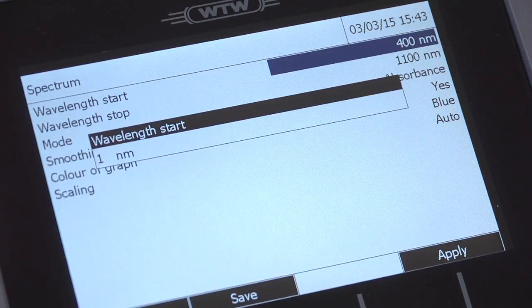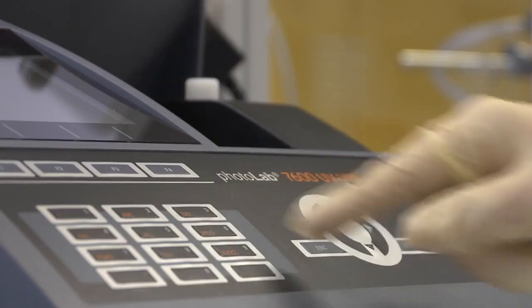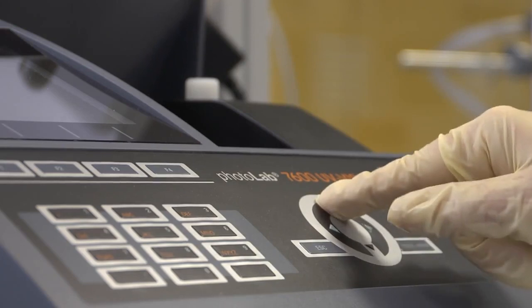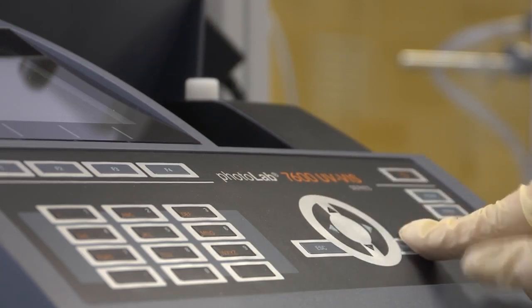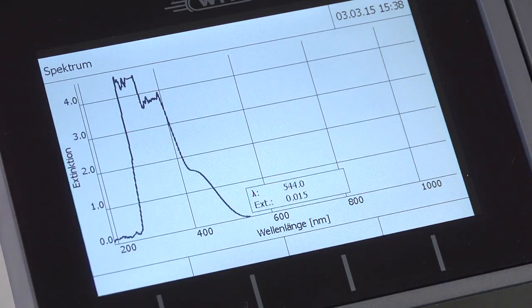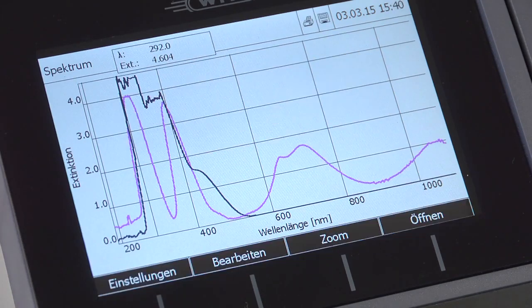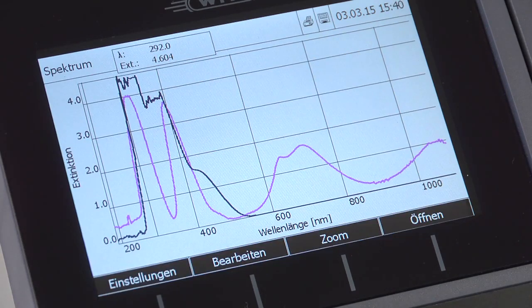We run the spectrum from 190 to 1,100 nanometers and put in these values. We are now going to compare the spectrum with a reference spectrum, and we can see clear discrepancies. A spectrum can therefore be used in quality control of substances, for example to monitor incoming goods.